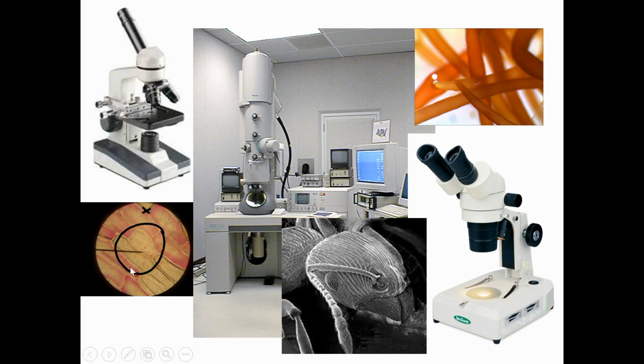So just a quick note, when you're looking through here, there's always going to be this black line that's in the middle. All right, that black line right there is the pointer. Okay, that's part of the microscope. So typically what you want to do if you want to look at something at a higher power is make sure that the end of the pointer is on that object.